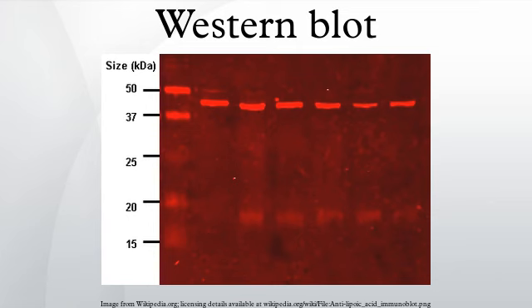Protease and phosphatase inhibitors are often added to prevent the digestion of the sample by its own enzymes. Tissue preparation is often done at cold temperatures to avoid protein denaturing and degradation. A combination of biochemical and mechanical techniques comprising various types of filtration and centrifugation can be used to separate different cell compartments and organelles.